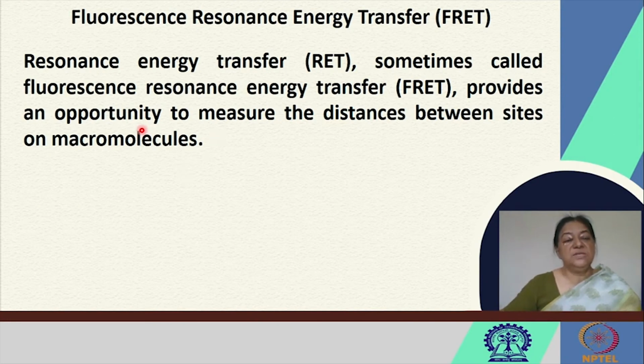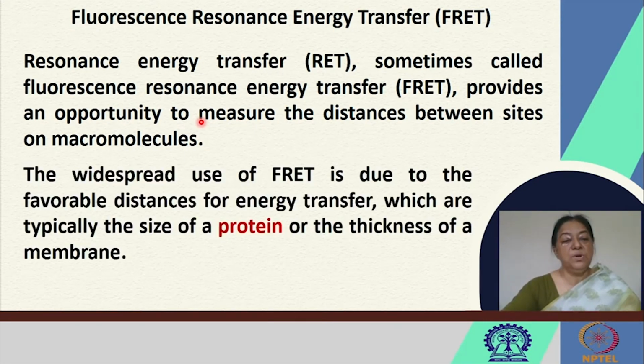Resonance energy transfer gives us a method to measure the distances between sites on macromolecules. The important part is that FRET is used due to favorable distances for energy transfer, which are typical of the size of the protein and also of the thickness of the membrane.